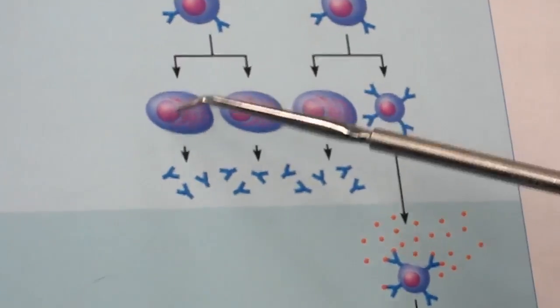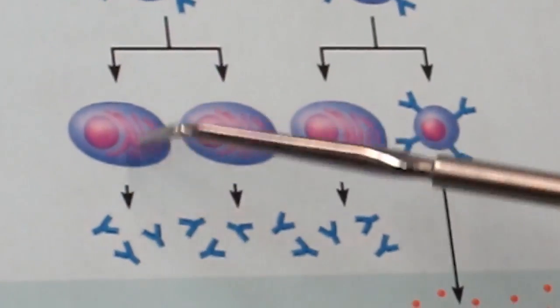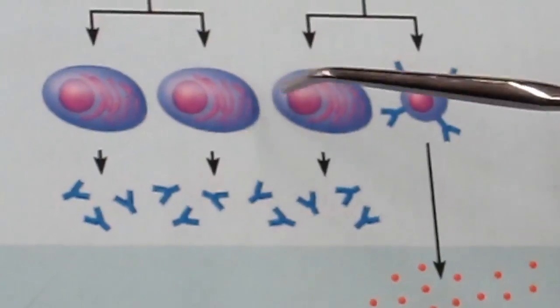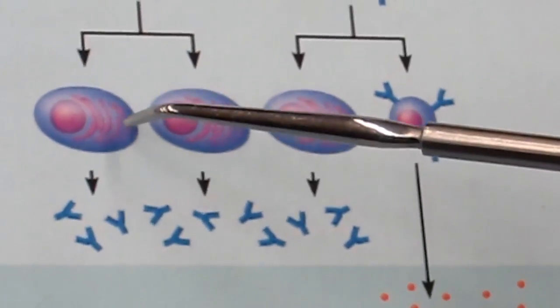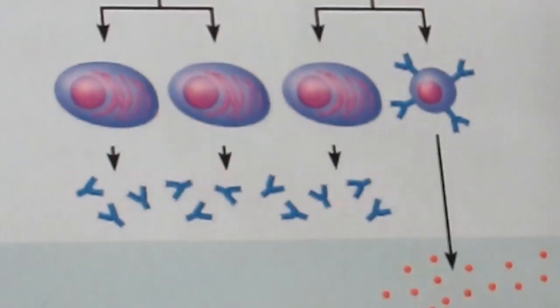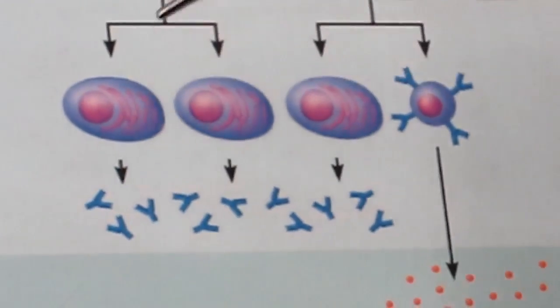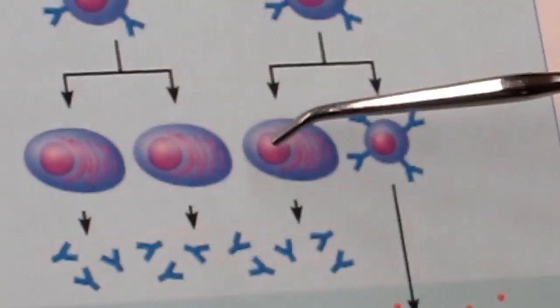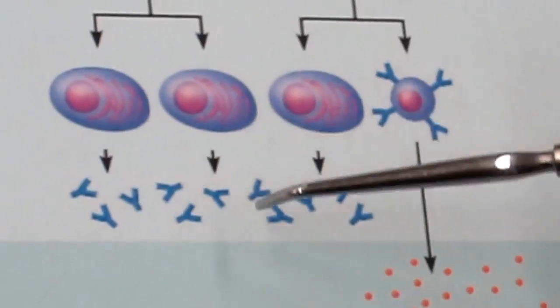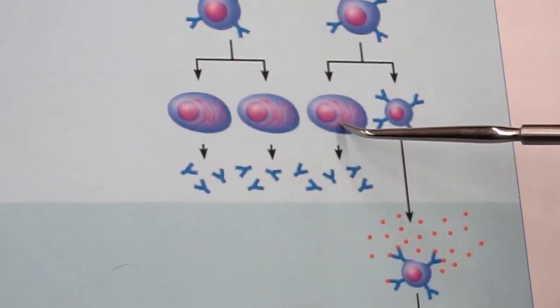Now, you can see the round nucleus in there, and how each cell is kind of oval shaped. You can see there's something squiggly inside the cytoplasm. That squiggly material represents rough ER, so it's telling us in the picture that this cell produces a lot of protein. It will have a lot of organelles that help with protein synthesis: rough ER, ribosomes, Golgi apparatus, lots of all of those. The protein these cells are producing are antibodies, so these plasma cells are basically like antibody factories.